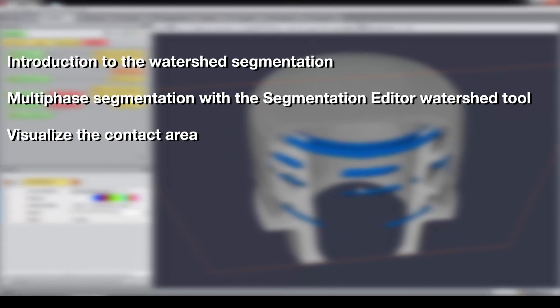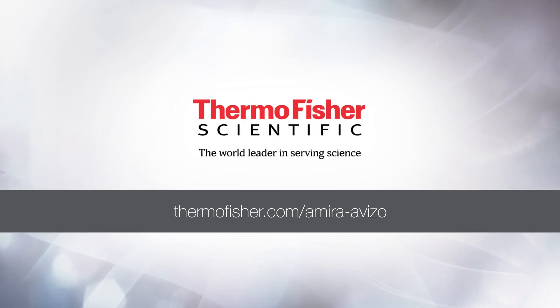As a summary, in this tutorial, you should have learned how to perform multi-phase segmentation using the interactive watershed tool of the segmentation editor, and visualize your results and the contact area of the different faces in your data. Goodbye, and thank you for viewing this tutorial!